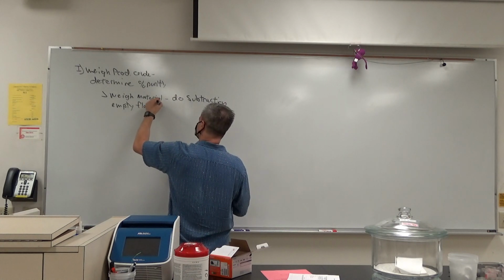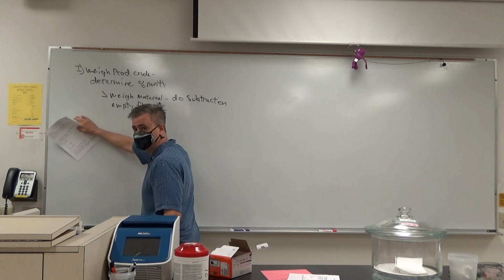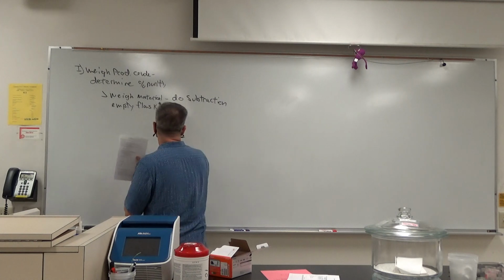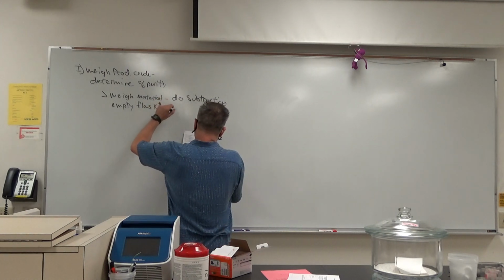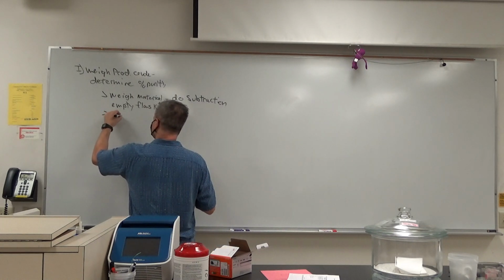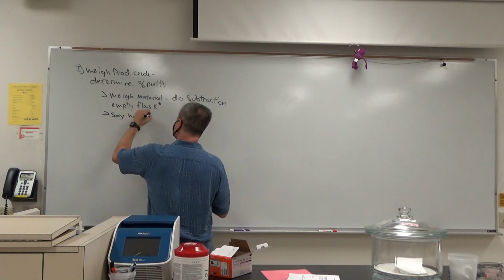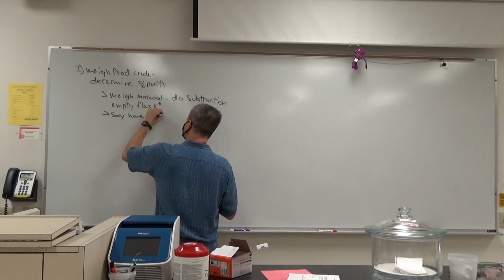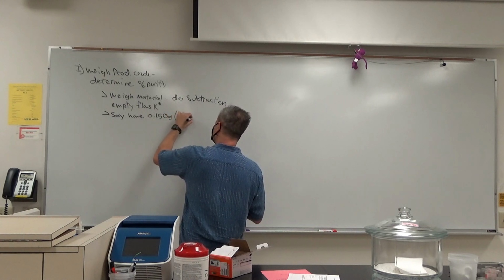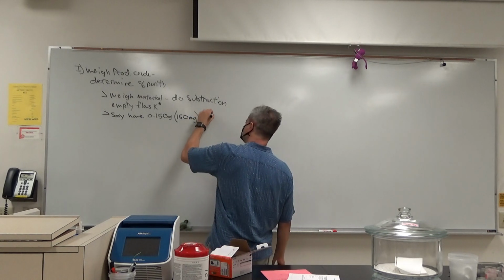That little star means if it ends up being greater than 250 milligrams, 0.25 grams, or if it's negative, come see me. We'll talk about it. Okay, say we have 0.150 grams, which is 150 milligrams.